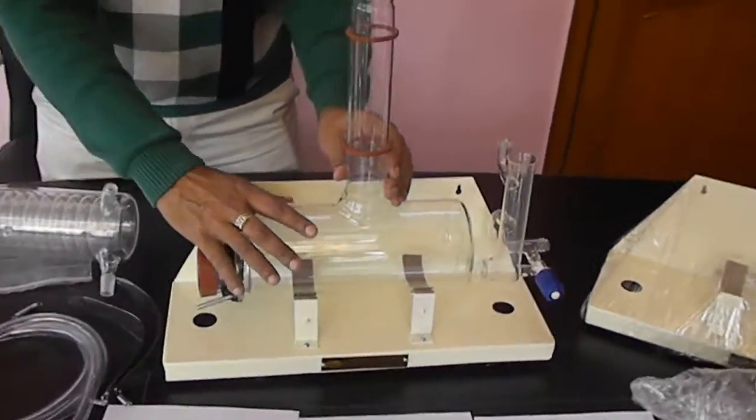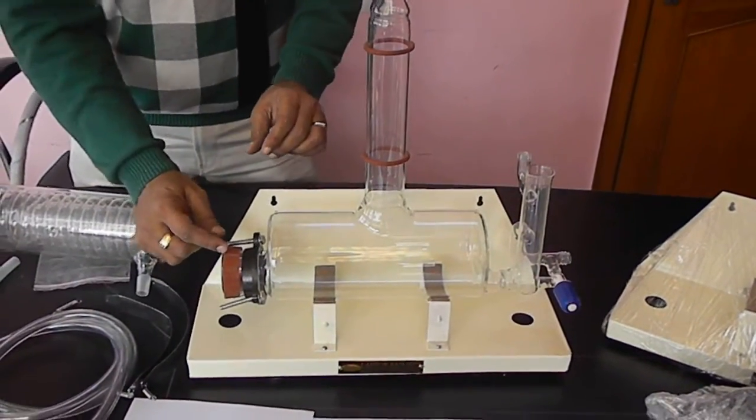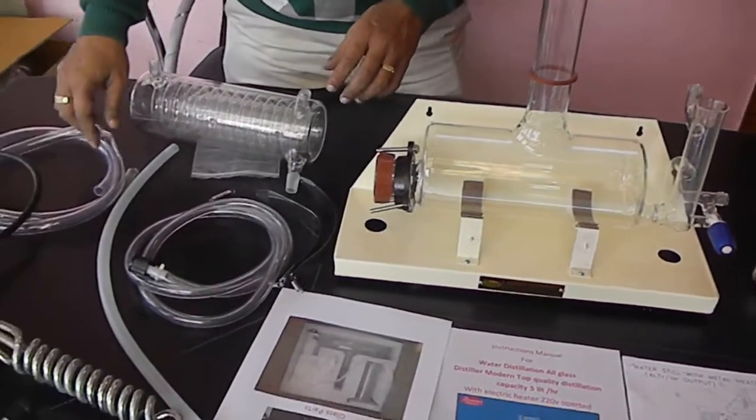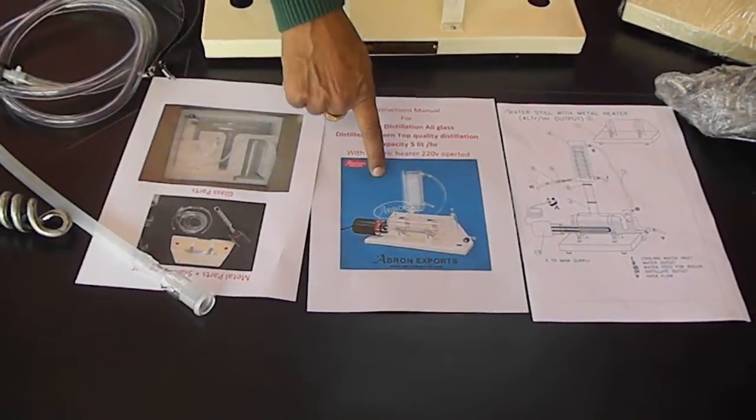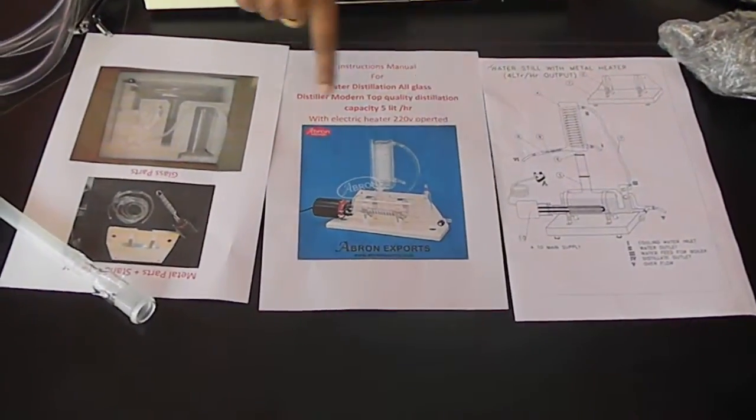It has a glass heating chamber, heater, adapter, rubber tubes, silicone tubes, and output. The manual is provided. This is the distillation after assembly and all these parts are labeled.